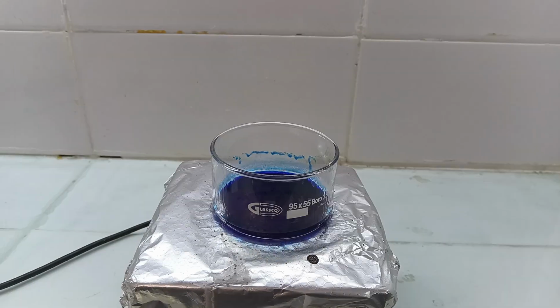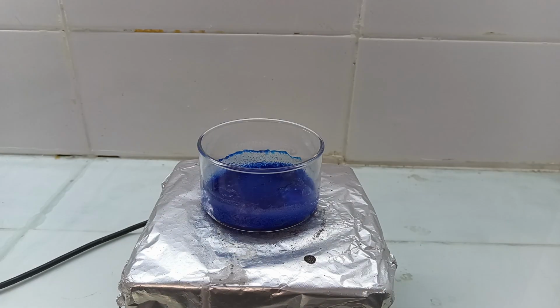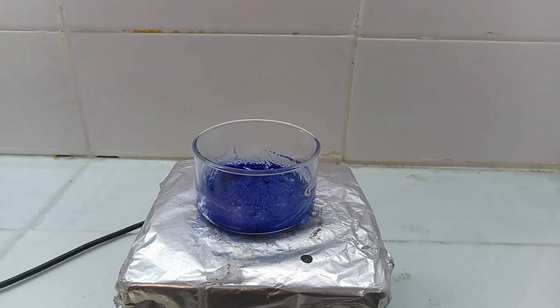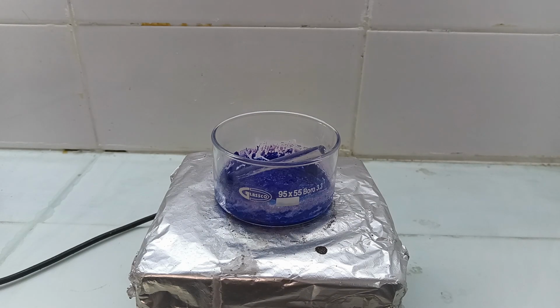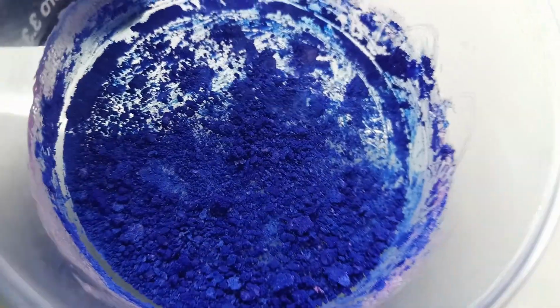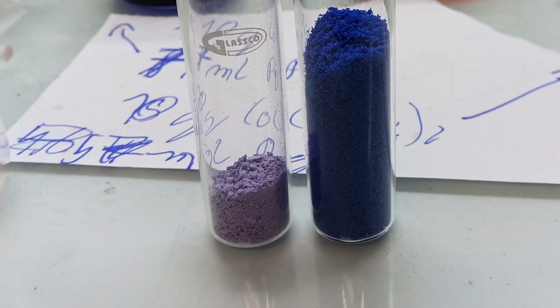And while drying, the complex redissolved into the small amount of hot ethanol left, and after drying completely, it turned into a blue powder. But after some time, the powder changed color back to the light purple.